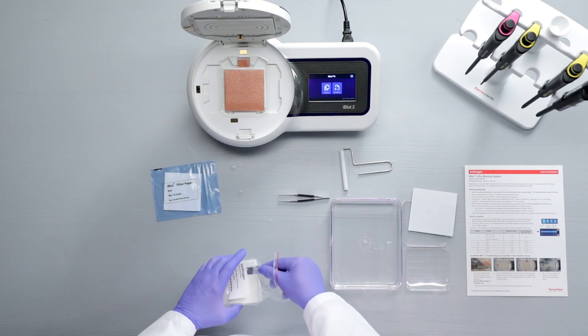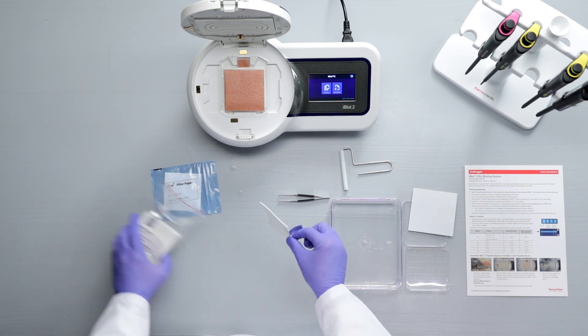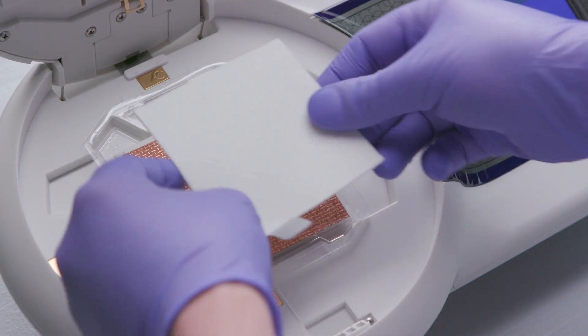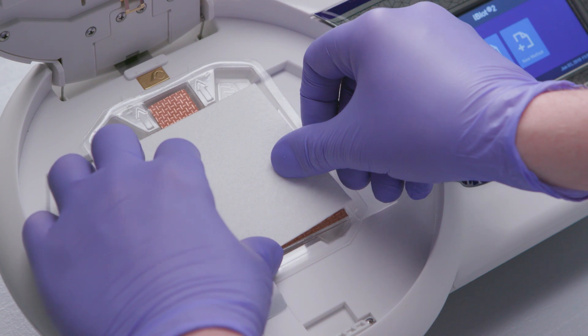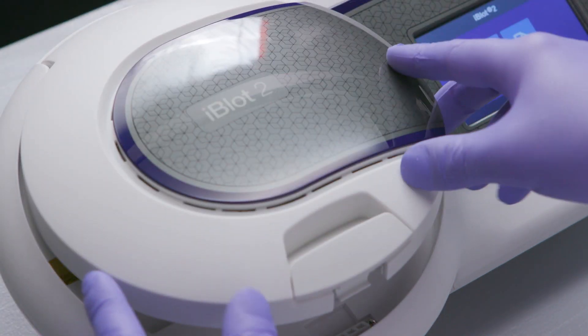Place the absorbent pad on top of the top stack. Again, be sure that the electrical contacts are aligned with the corresponding contacts on the blotting surface. Then, close the lid.